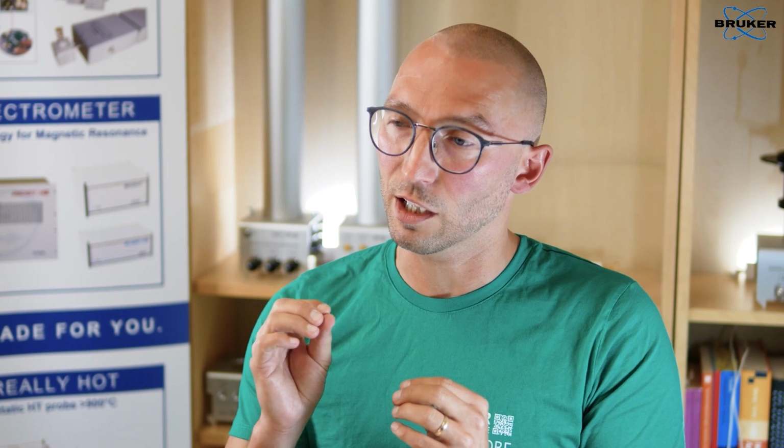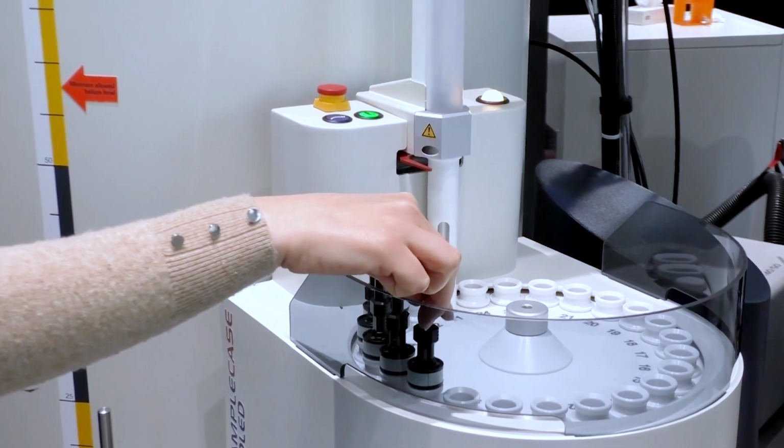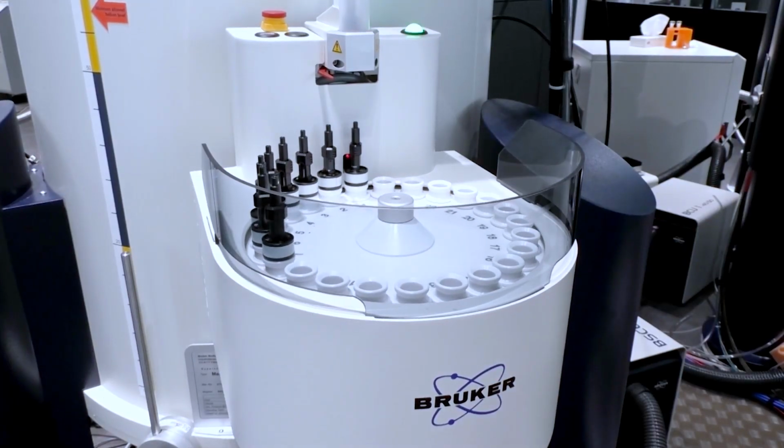And the technique of solid state NMR is then sensitive to all of these processes happening. It can actually help us to visualize what is going on with the interfaces. There are things called the solid electrolyte interface and other things that are happening when the electrolyte is breaking down, or when we have short circuiting of the cell and other things, where solid state NMR can help us to learn something about all the materials and all the processes happening.